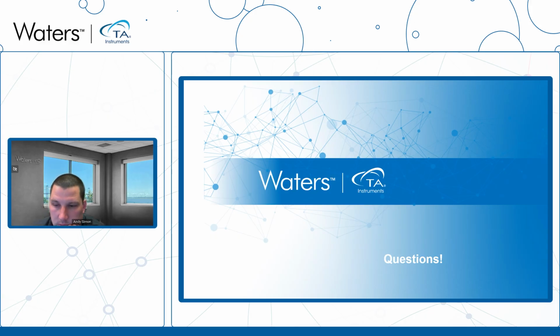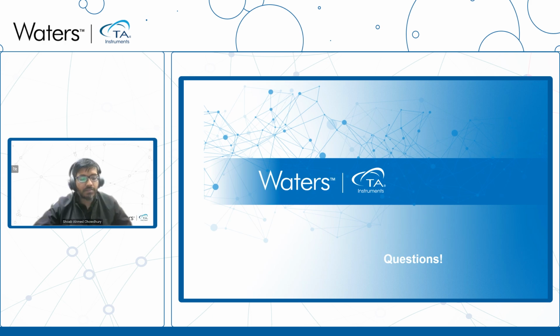Okay, so both of the samples are actually of the same material. The knit line here was introduced to replicate non-ideal conditions, which can come from your manufacturing as a form of manufacturing artifact, a void or residual stress. So what we did was take two materials formed by two different molding processes, one with a single gate, one with a dual gate, and then perform a tensile test on each of those same geometry dog bones.